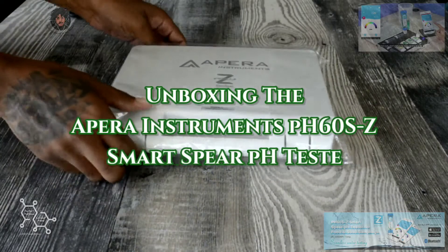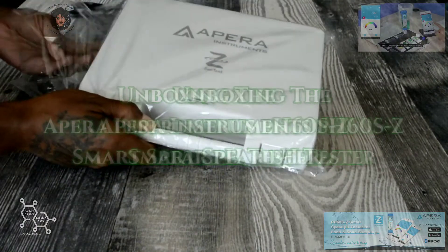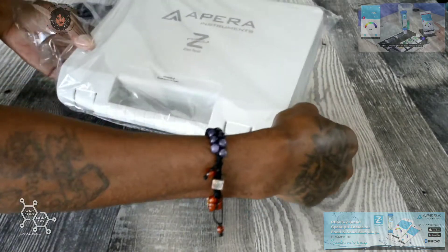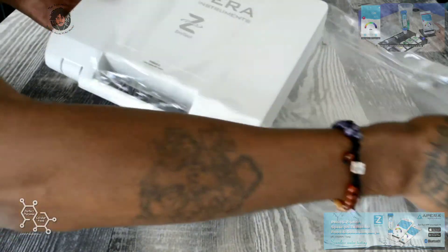Peace and love, it is the Alkaline here. Today we'll be going in on the Appearance Instruments Zen Test — this is a smart spear pH tester.